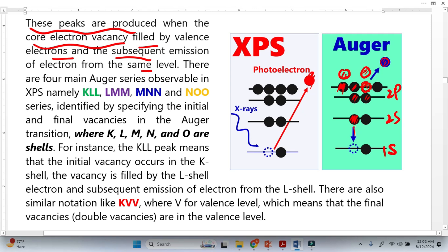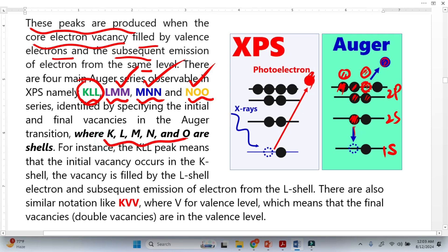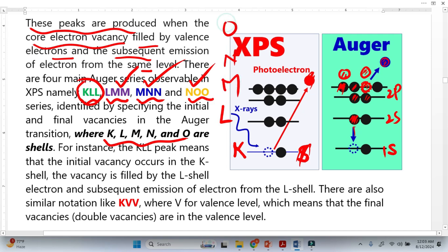There are four main Auger series observable: KLL, LMM, MNN, and NOO — very important. In small elements we will only see KLL. In bigger elements like lead, we will see LMM, and in very large elements we will also see MNN and NOO series. K, L, M, N, and O refer to the electron shells: K is the first shell, L is the second, then M, then N, and O.